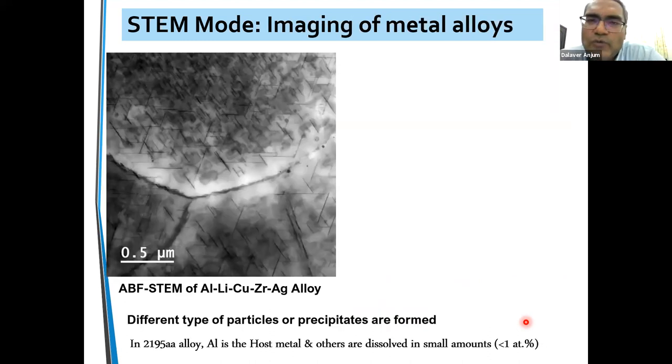Okay, so far I gave you the imaging and element information. Let's talk now about what I can do about the bulk properties. For that, this is my research. I'm very proud of this research, I developed new things in it. But I will start with the aluminum alloy characterization first and then finish with the properties.